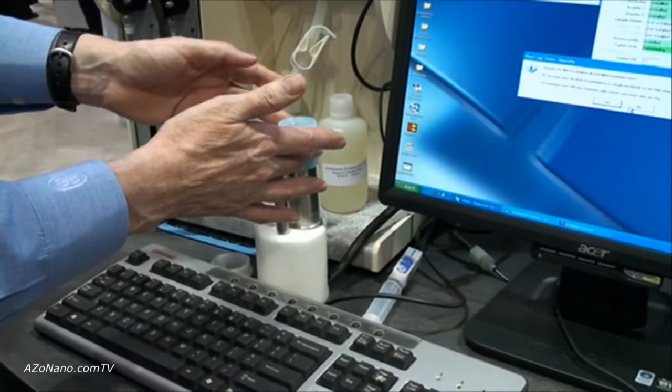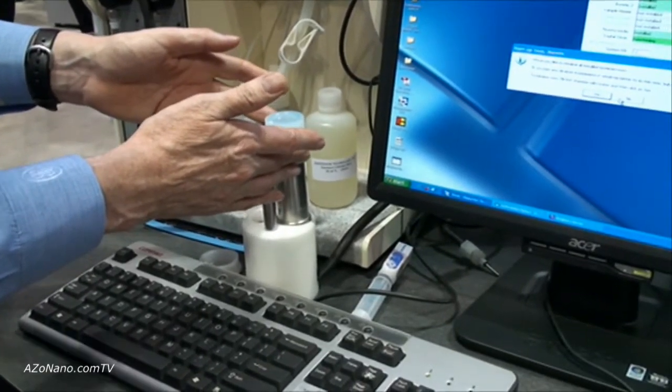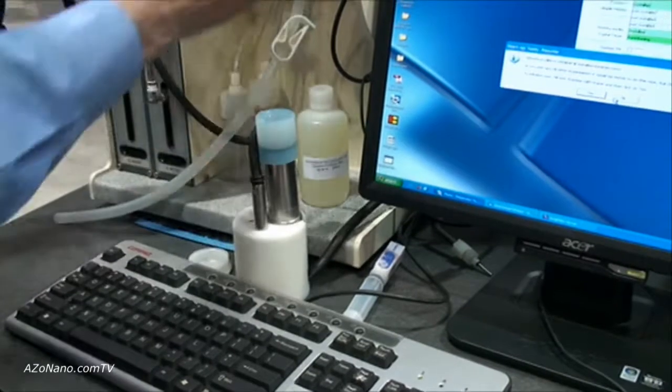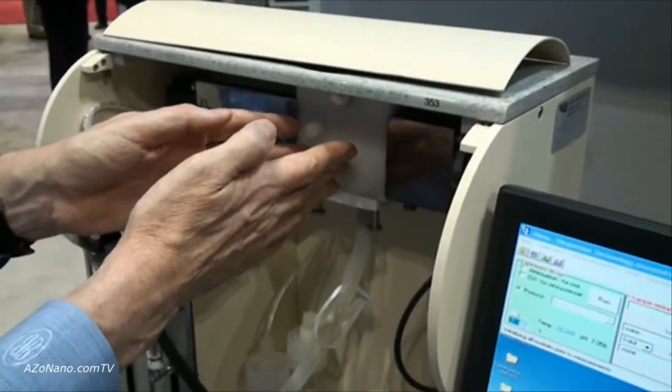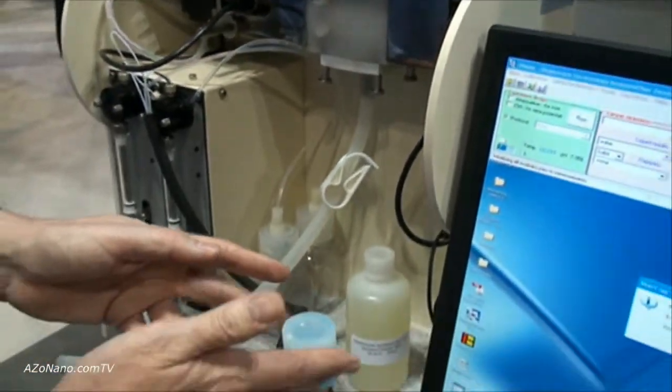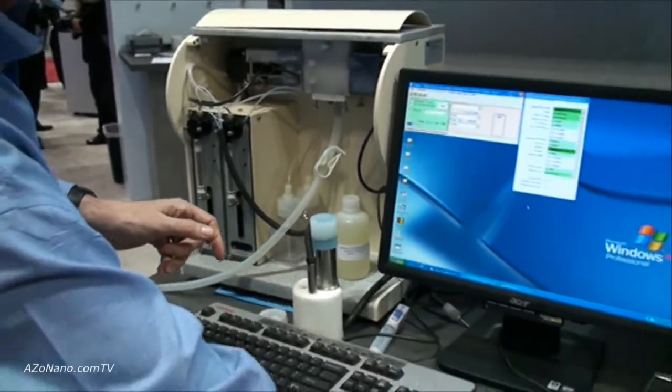All we need again here is to have the sample come in contact with the probe and it could be here as a separate measurement or mounted in the same chamber. So we measure particle size and zeta potential at the same time but as long as we're in contact with the sample we can perform a zeta potential measurement.